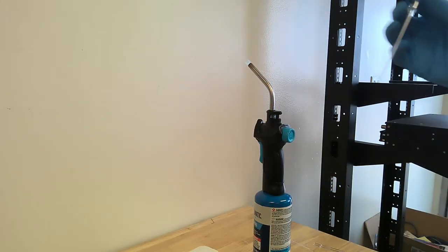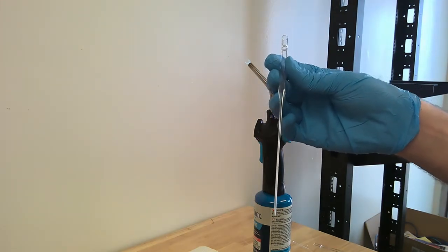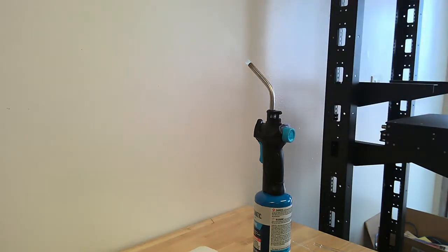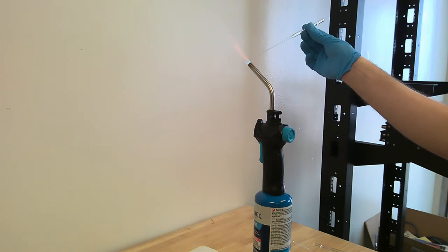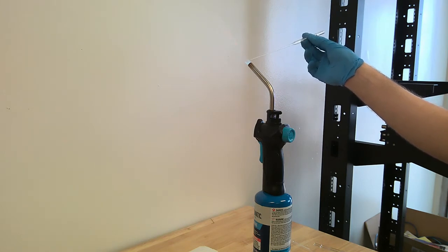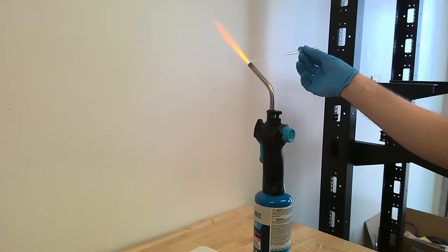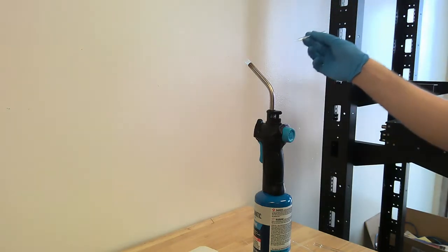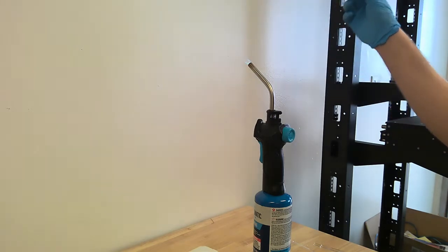So now we're going to showcase how to take a 7-inch pipette and generate a melting point and boiling point capillary tube. Well, the first step in this process is we're going to very carefully heat the tip of our pipette until the tip is completely sealed. We only need to gently immerse it in the flame, and we're going to very carefully roll the pipette back and forth as we immerse it in the flame. If all goes well, we should end up with a nice seal in which there are no air bubbles.